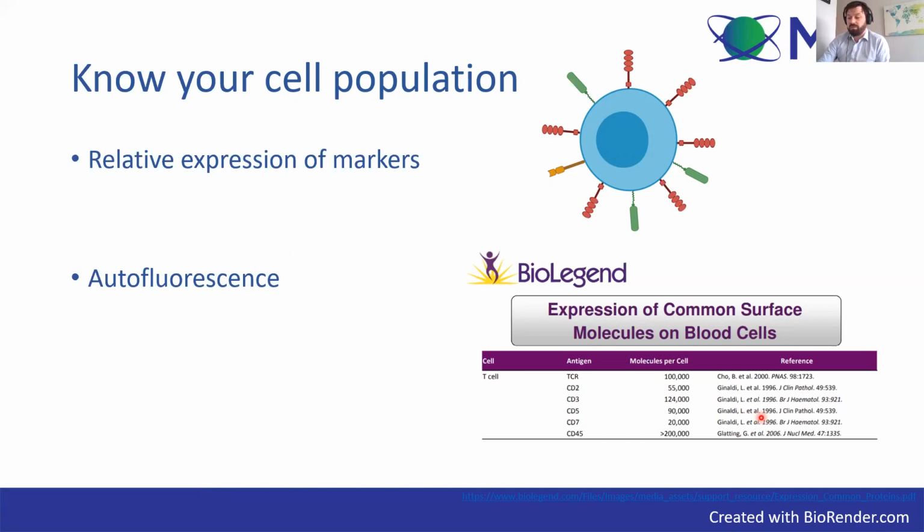This can cause problems when you're trying to analyze your results. It can reduce the sensitivity and it can give you false positives if it's particularly bad. So having good controls can definitely help. But if you have very autofluorescent cells, sometimes if you know this, you can use different fluorophores and avoid the channel altogether, thereby minimizing the problem. So it does help to know if your cells are very autofluorescent before you start.